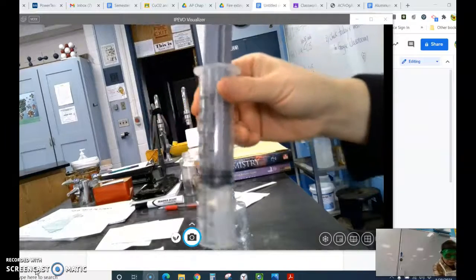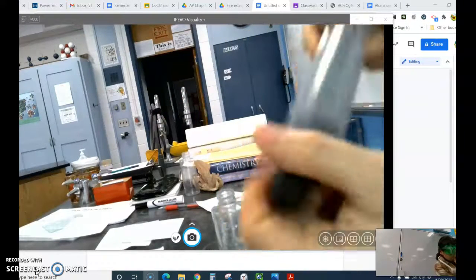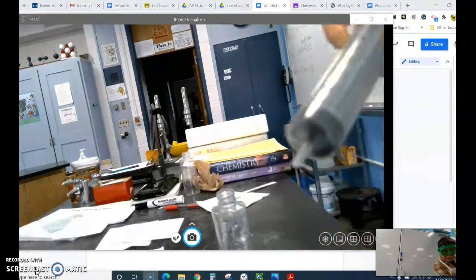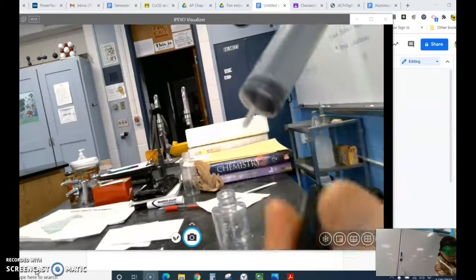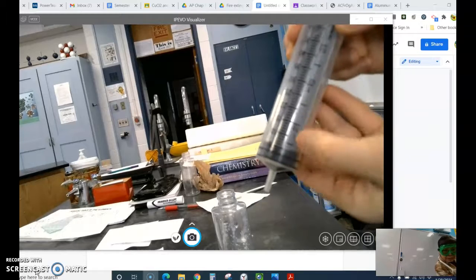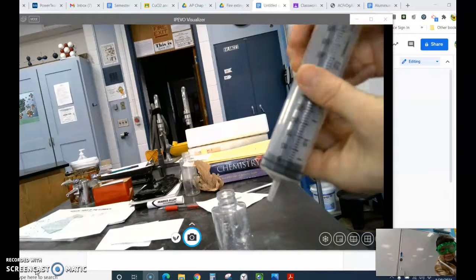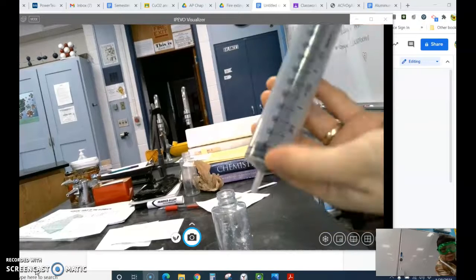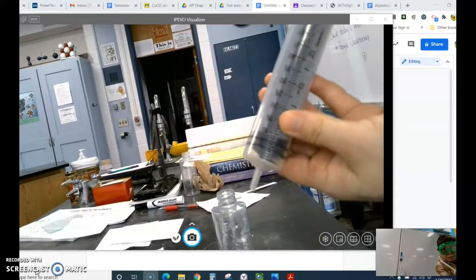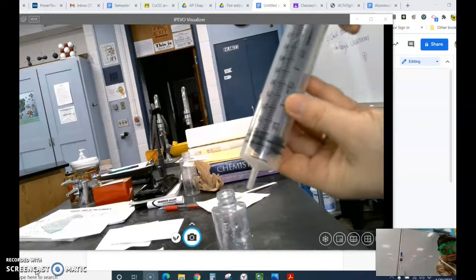Here is the device. You use this device to collect the vinegar. I take off the rubber stopper first, so I can use this labeling to get the volume I need. This part has 2 lines, and we use the front line to read.